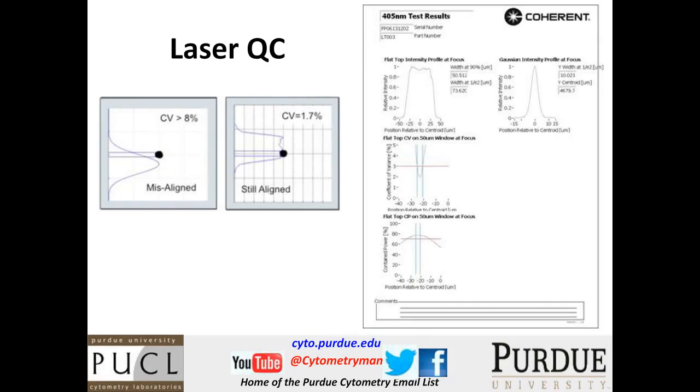So there's a huge difference in intensity at this point if the beam is shaped this way. But that's not the same problem if you have this tophat. And it doesn't really matter if the cell comes in at any of these places. It's going to get the same amount of intensity.